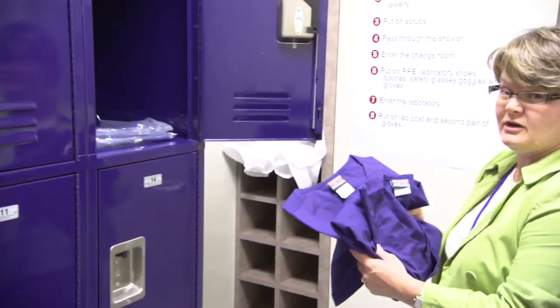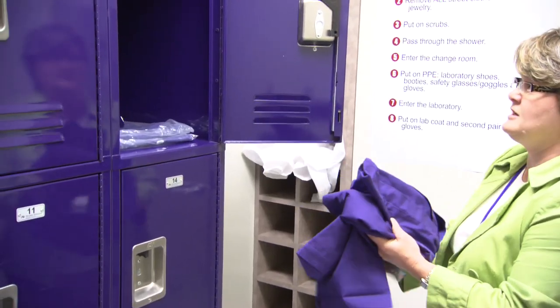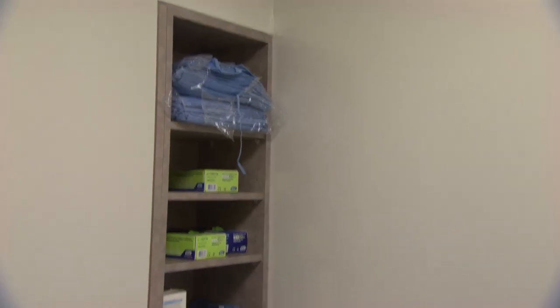Standard minimal personal protective equipment when you're in containment, just to go into the main — what we call the clean hallway before you get to a laboratory — you're going to leave all of your street clothes, all your jewelry, everything behind. You're going to wear scrubs and dedicated socks, underwear, and shoes dedicated for inside containment.